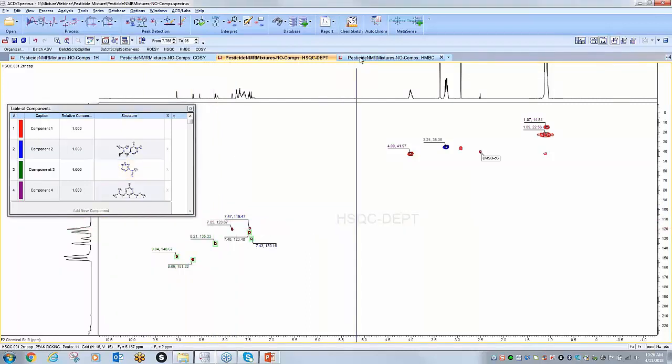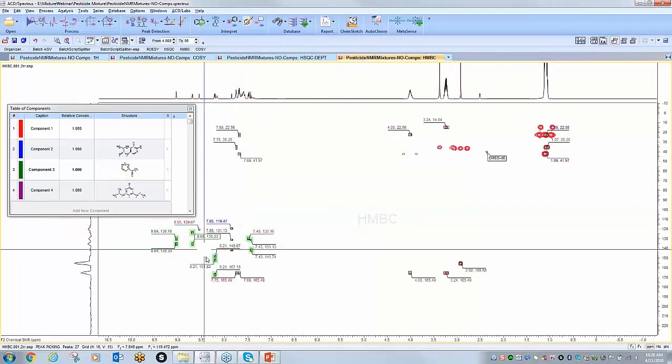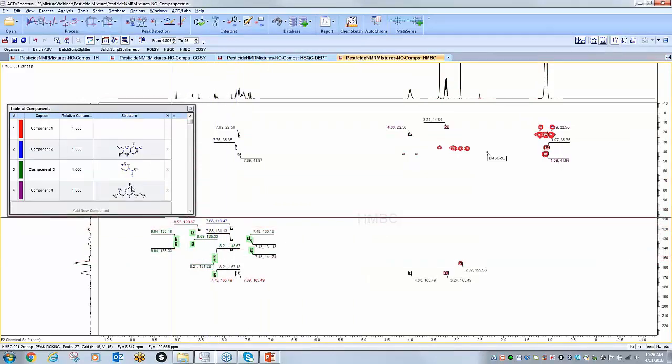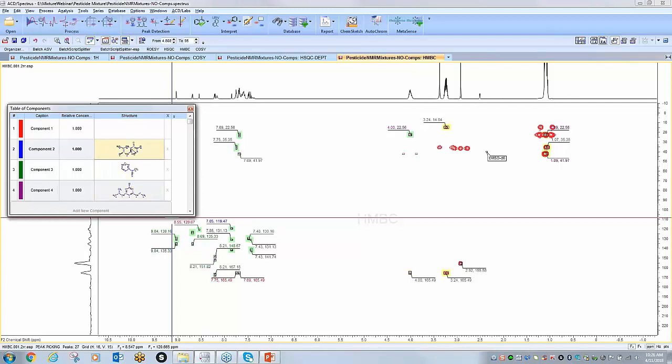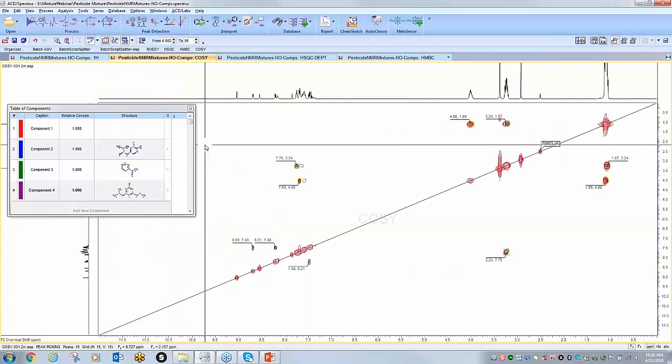And if I move over to my HMBC, you'll see that all the assignments have been transferred across, so this helps for your structure verification capabilities. As well as I could do the same for the COSY and the proton NMR.